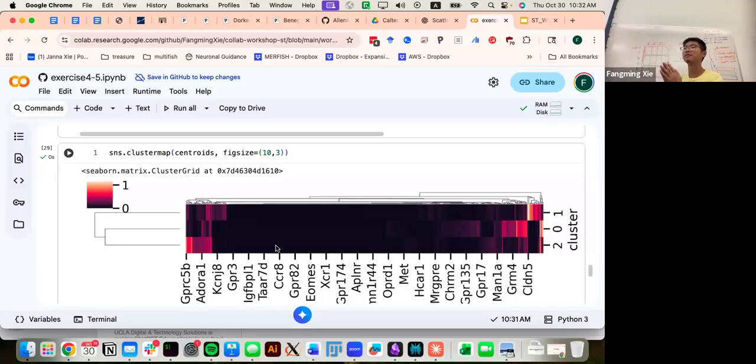Each gene has its different function, and a different baseline level of expression in a given cell. There's no point showing the variation of two different genes together. So that's why we z-score things. By z-score, we mean we compare every gene relative to its baseline rather than the absolute value.